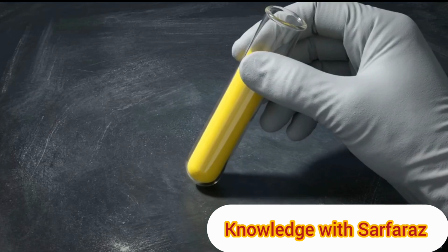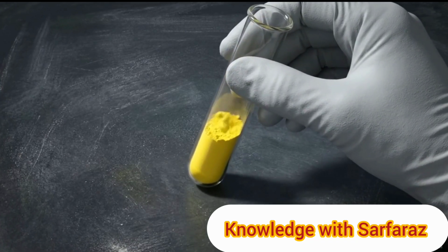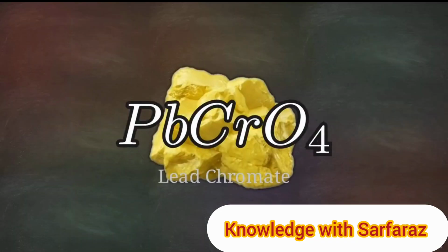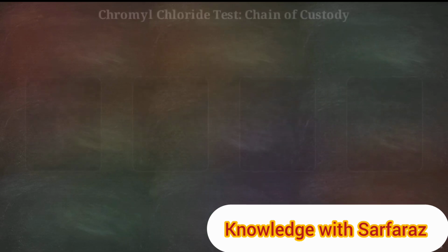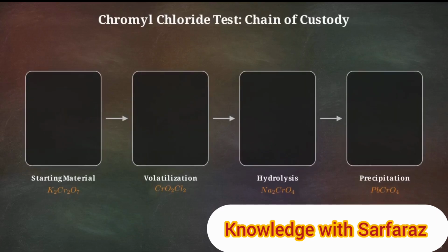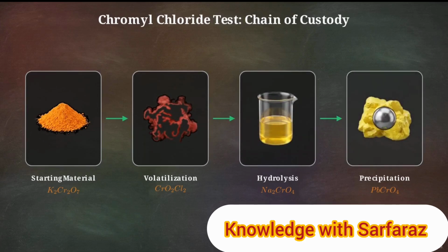There is a paradox at the center of this experiment. We perform this entire procedure to prove the presence of chloride, yet the final yellow solid used as the definitive proof, lead chromate, contains no chlorine at all. We achieved this by tracking chromium through 4 states, starting as an orange powder, volatilizing into a red gas, hydrolyzing into a yellow solution, and finally precipitating as a yellow solid.